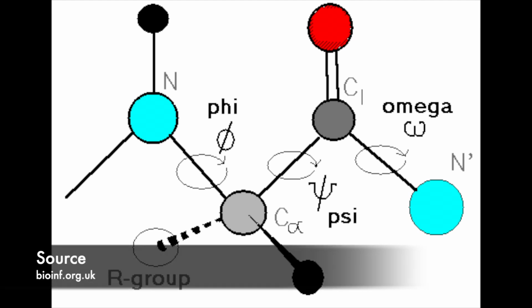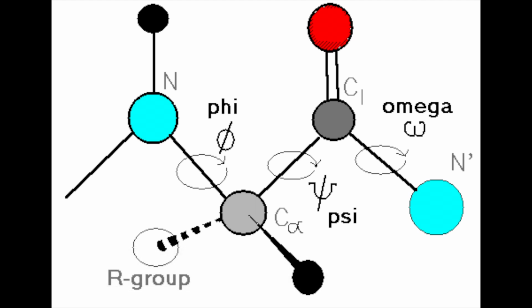And basically, one of the most important things that it looks at and that we fix are so-called Ramachandran outliers. You can have this Ramachandran plot, which is looking at two very specific bond angles, and I'll show it on screen here. What we're looking at here is this amino acid. We have the amino group on the left, the carboxyl group on the right, and then the alpha carbon in the center attached to a hydrogen, as well as the R group.